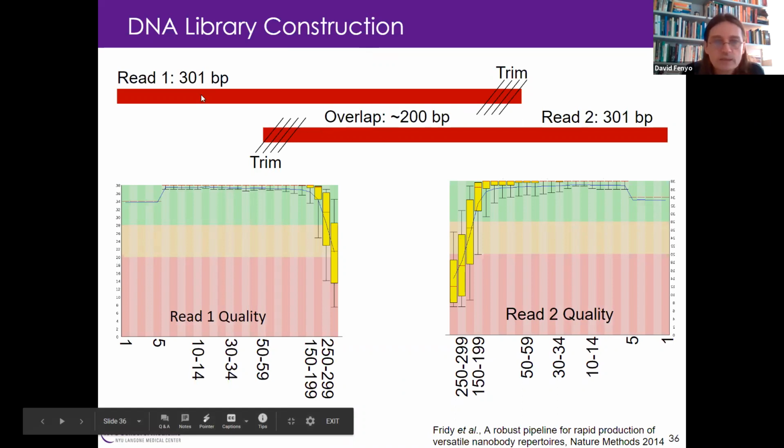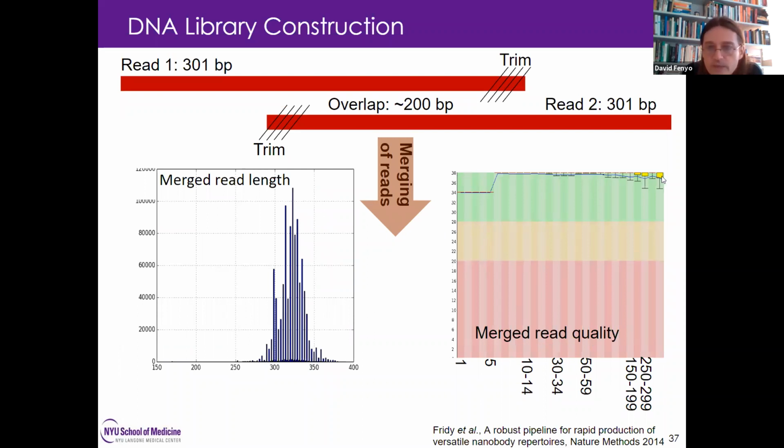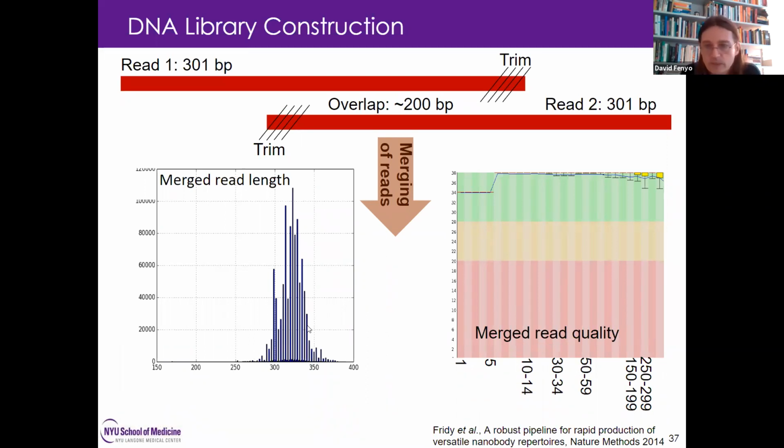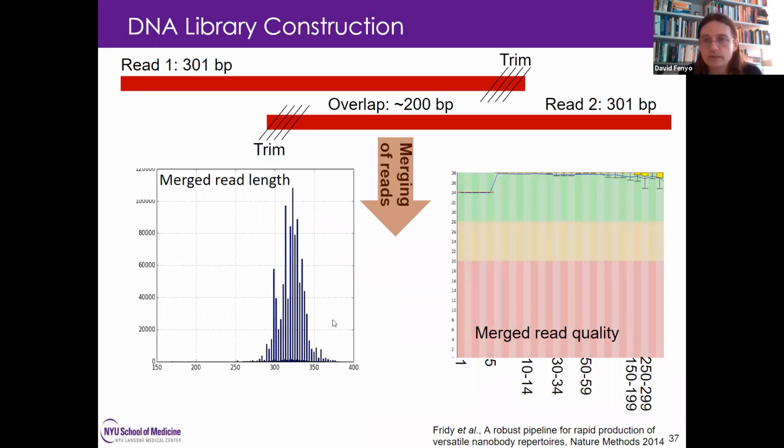In this case, we use MiSeq, which will give you paired reads of about 300 base pairs each with quite a large overlap. But the quality is very poor at the end of each read. The nice thing is that where the quality is very poor for one read, it is pretty good for the other read. So we can put them together. This shows the quality of read one, which goes down at the end dramatically, and of read two, which also goes down. But if we merge them, we get high quality for the whole region. And this shows the distribution. We have peaks here at every three nucleotides, corresponding to an amino acid difference between these. So we get a lot of high quality sequences of the full length of the variable region.